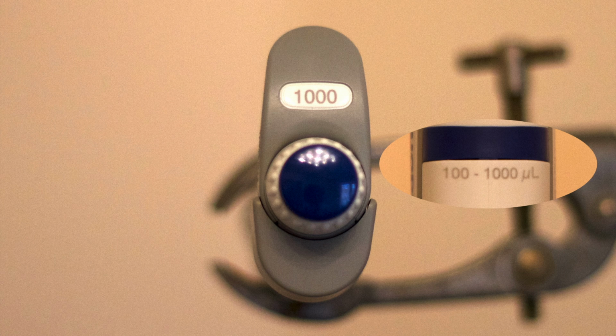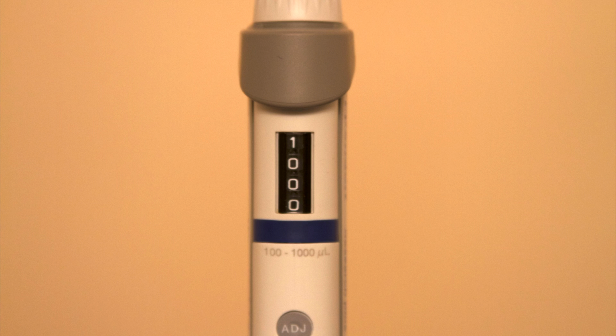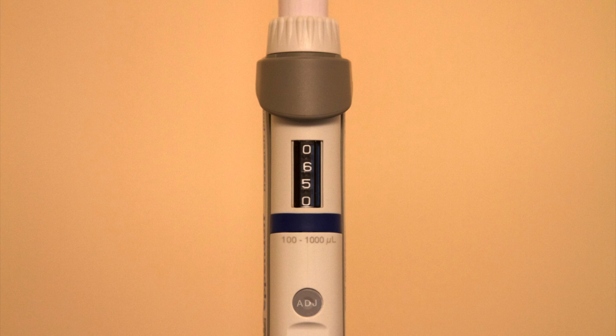This tells us that the pipette is accurate across the volume range of 100 to 1000 microlitres. Therefore, the largest volume this pipette can dispense is 1000 microlitres and the smallest is 100 microlitres. On the window display, 1000 therefore represents 1000 microlitres. Again, the upper number is thousands, followed by hundreds, then tens, and finally units. Therefore, this pipette could be used to set a volume of 650 microlitres.